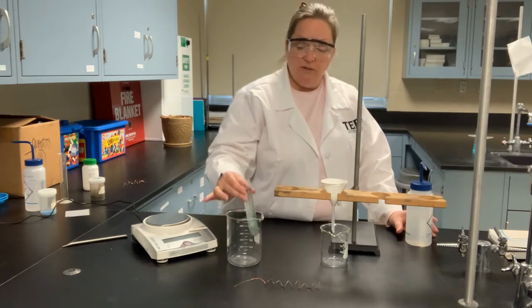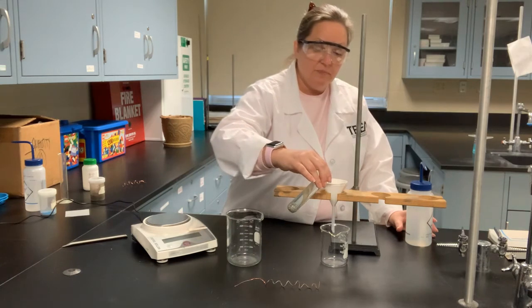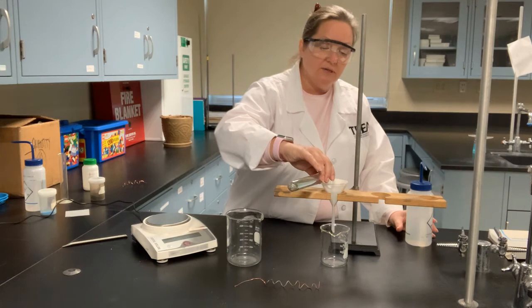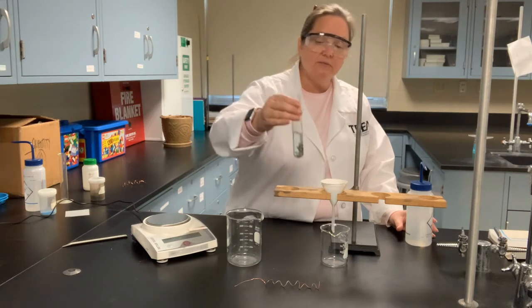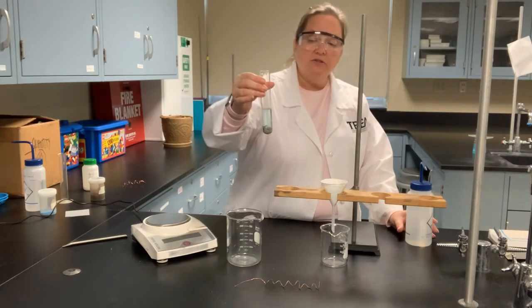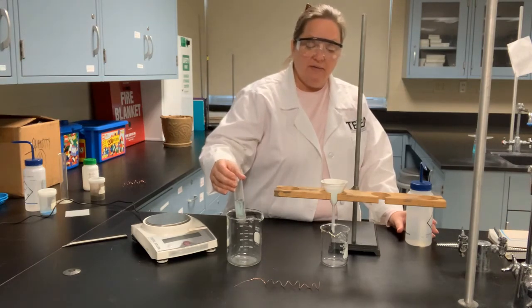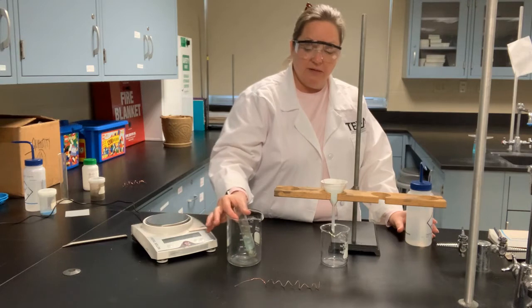Now I've got quite a bit of liquid here, so I'm actually going to go ahead and pour a good bit of this solution off the top initially and let it run down before I even try to transfer any of that metal, because I don't want to pour it and have it splash and then lose a lot of my sample in the process.